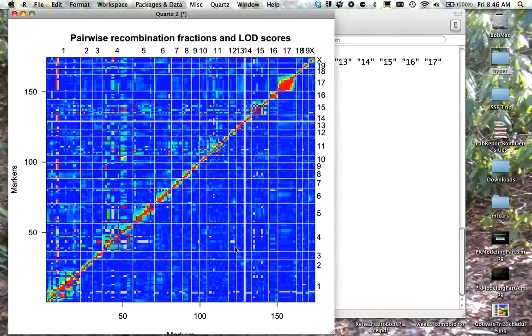Maybe when we were phenotyping or genotyping this data, a little bit of dust got on the experiment. So I'm looking for red hotspots in this LOD region down here. I've got a few down in here on chromosome 4, but nothing to worry about. I don't see any particular hotspots over here. On the top here is what's called the recombination fraction, and I've got some hotspots there, but those are okay.